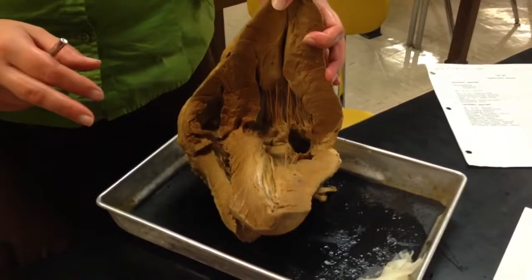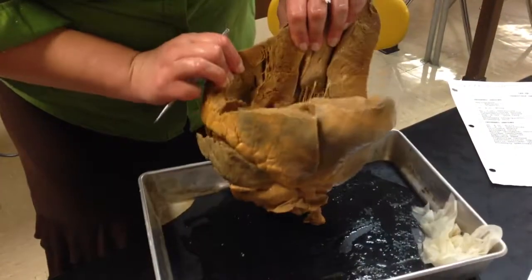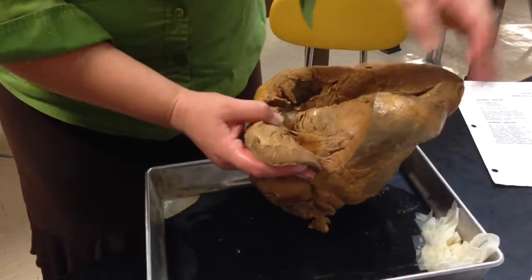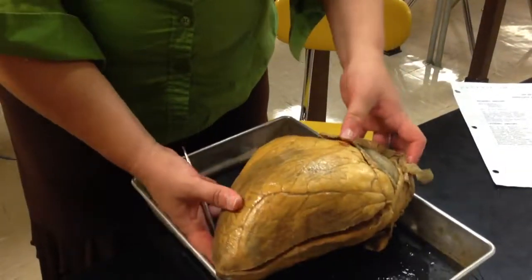That's all I can think of. So the moderator band, that doesn't have one, right? This one does not. So is it in the left ventricle or the right ventricle? Right ventricle, and it's like a really thick trabeculae carneae. Okay. It looks really thick.